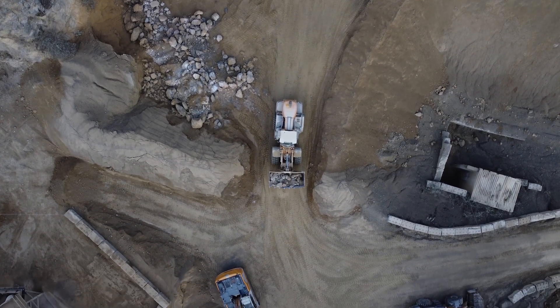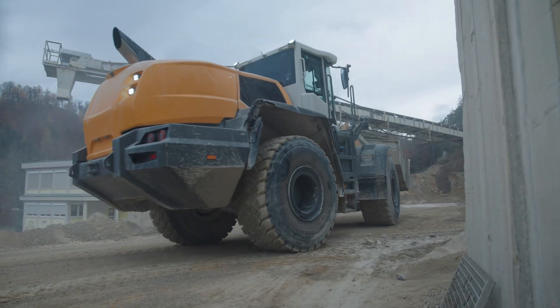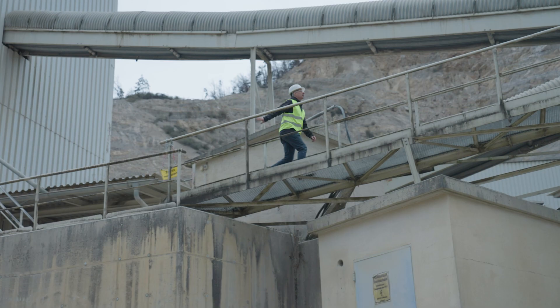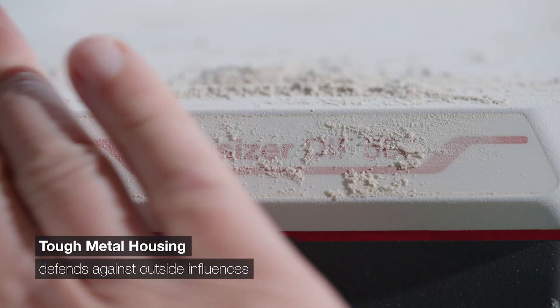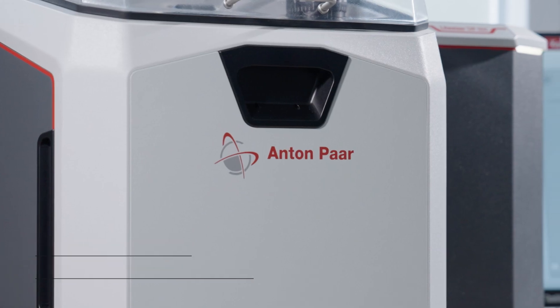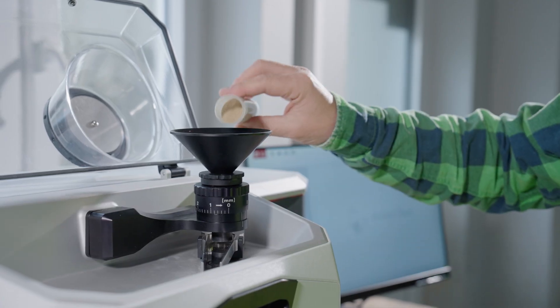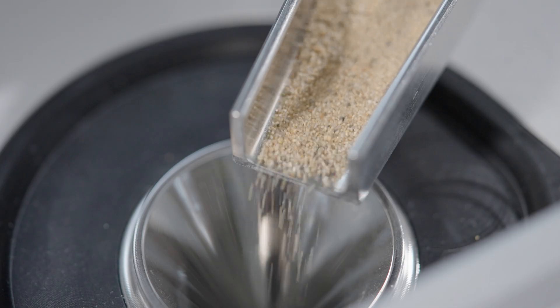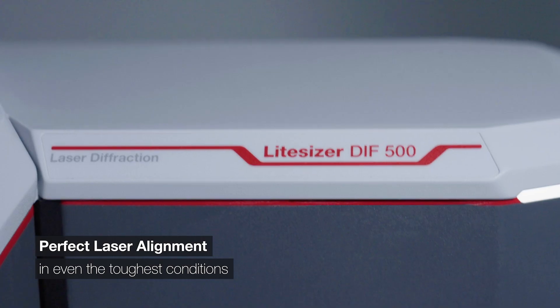Our laser diffraction instruments are renowned for their durability. And this one's no different. Tough metal housing and high-quality sealings protect against outside influences such as dust and water. Shock absorbing elements ensure outside vibrations can't disturb the optics and allow for perfect laser alignment even in the roughest conditions.